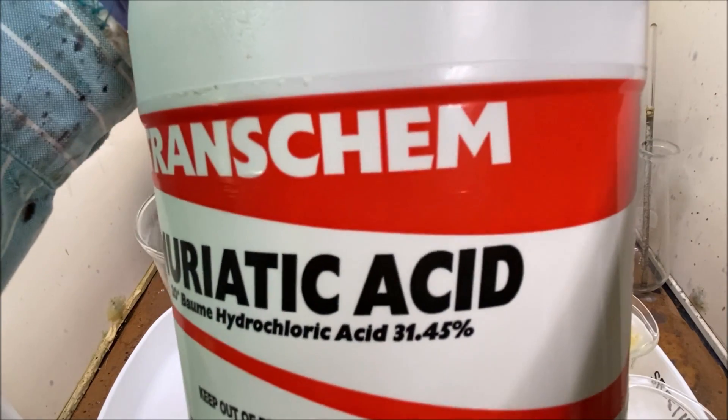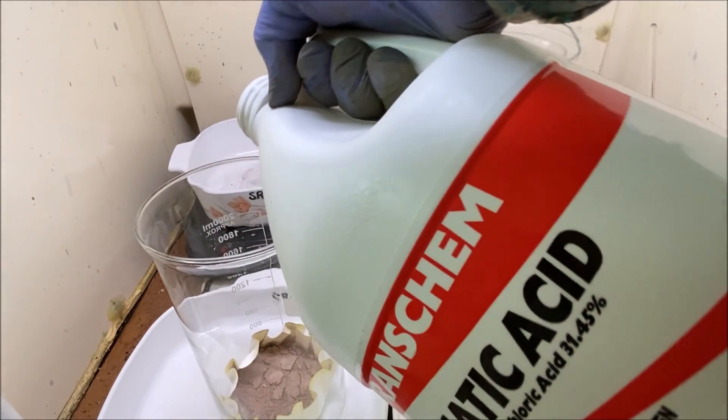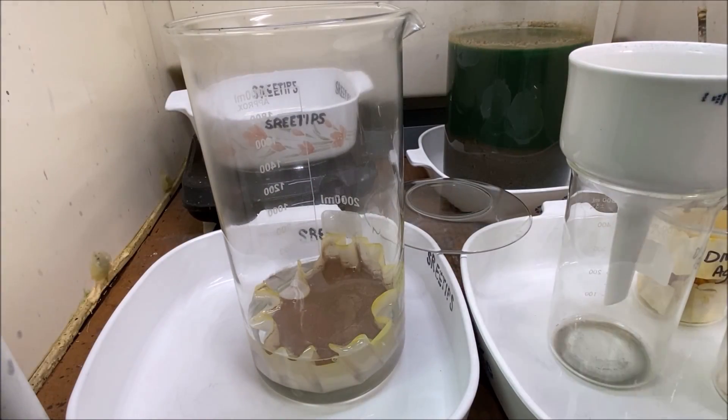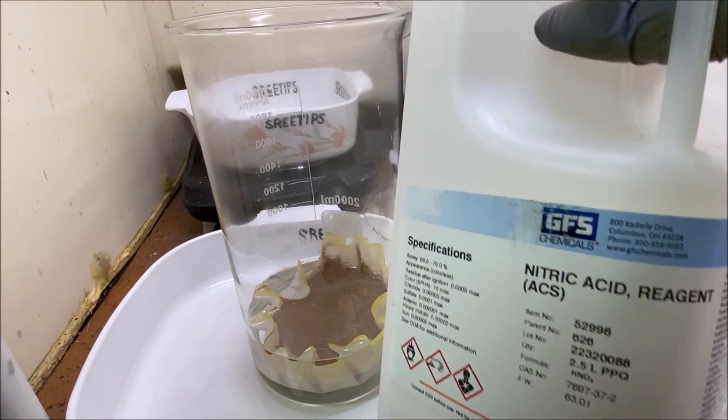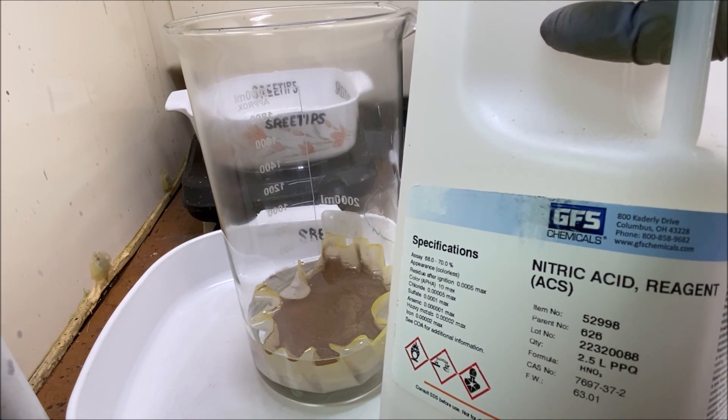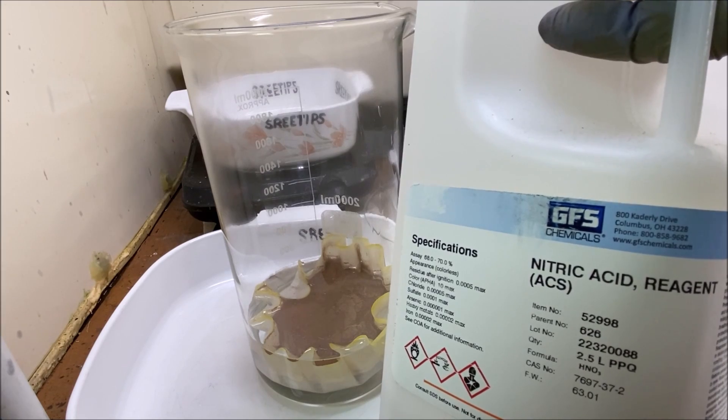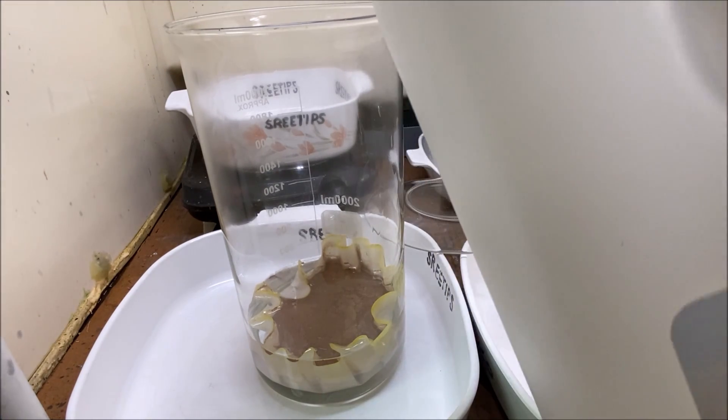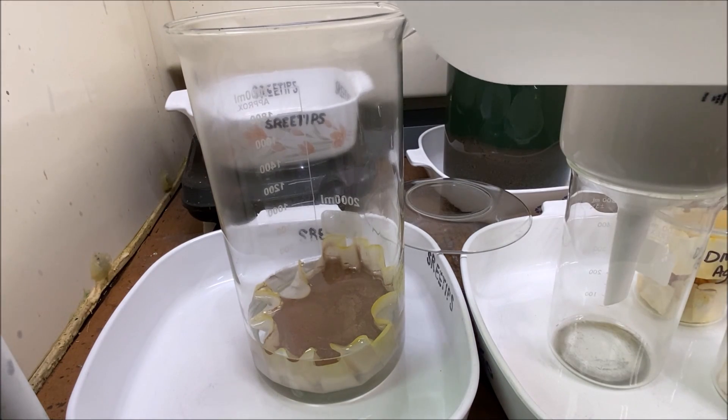I'm adding hydrochloric acid to this. Usually with this kind of material the first extraction gets 95% of all the precious metals that are in the solids. We're going to do another extraction here. I'm going to add a little bit of nitric acid now to form aqua regia in here.